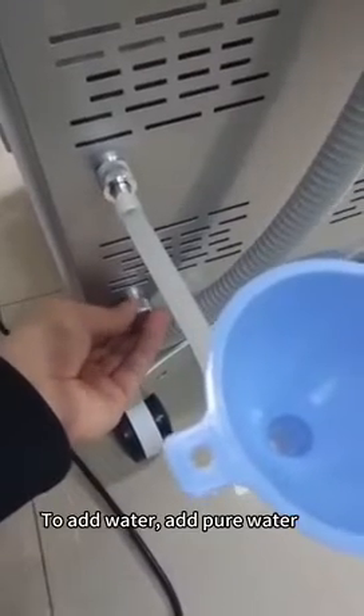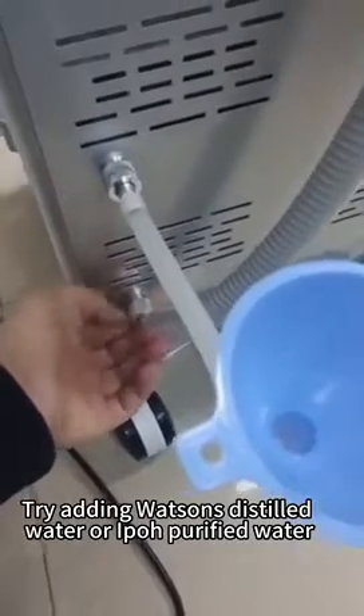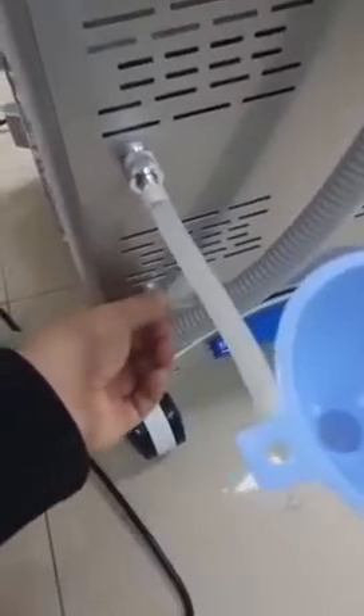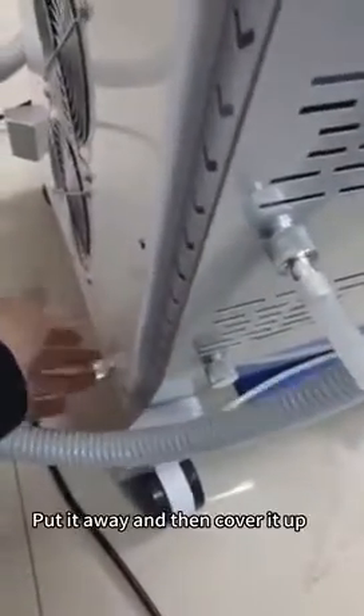When adding water, use pure water — distilled water or purified water. Water quality requirements are relatively high. To drain, open the drain hole, put it away, then cover it up. Open the overflow hole and refill when needed.